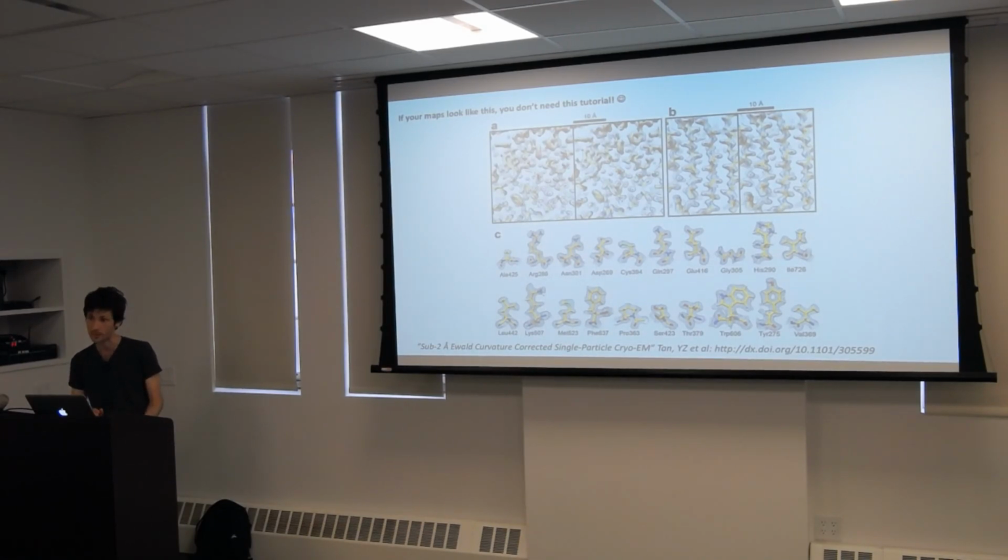They're Coulomb potential maps, and they can have different properties in terms of the intensity of different features that show up. So phosphates are going to be less prominent, and apparently hydrogens are going to be a lot more prominent at much lower resolution than we would expect from X-ray. This looks almost exactly like a 2 angstrom neutron map if you compare it. So really interesting. Anyway.